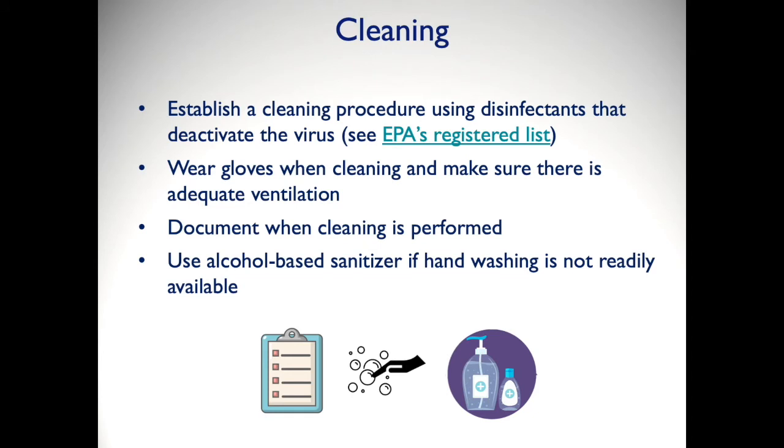It is important to establish a cleaning procedure using disinfectants that deactivate the virus. You can refer to EPA's registered list. Remember to wear gloves when cleaning and make sure there is adequate ventilation. Document when cleaning is performed. And use alcohol-based sanitizer if hand washing is not readily available.